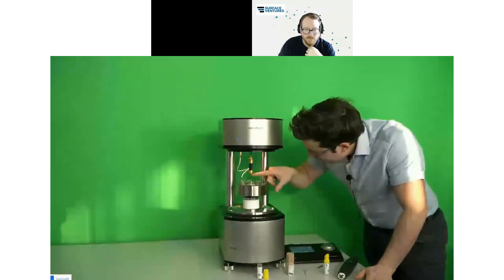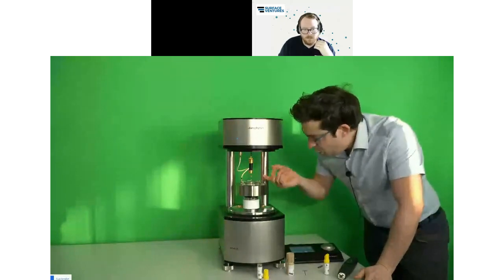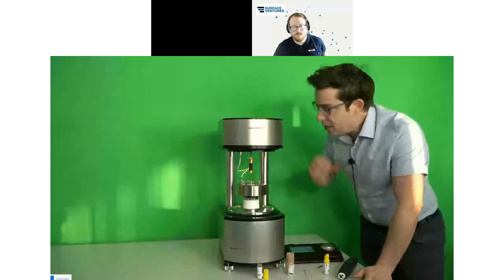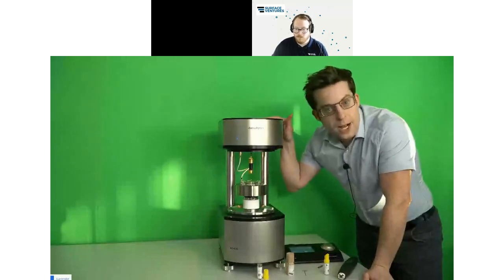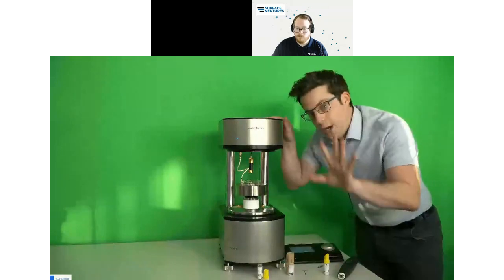And then, like before, it is done in a way that the stage automatically moves up until it contacts the lower end of this probe. Then through the holes, water by capillary effects races up into the fiber bundle. And the device is again recording the mass over time. From the mass increase over time, it then calculates the dynamic contact angles. Okay. So both single fibers and fiber bundles are possible.